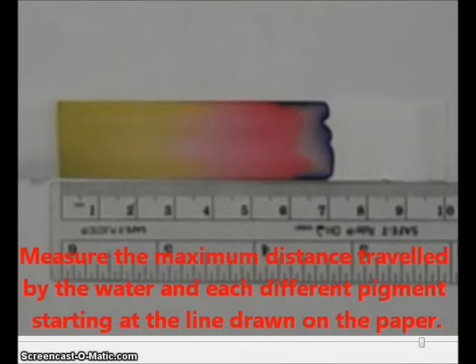To be fair, we should be comparing the distance traveled by the water starting from the same point where the pigment started traveling. So we'll measure all of our distances starting at this point. It looks like the maximum distance traveled by the water reaches about to here and then we can measure the maximum distance traveled by each of the different pigments.